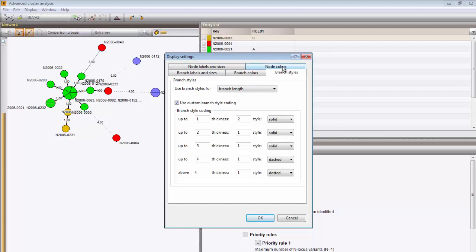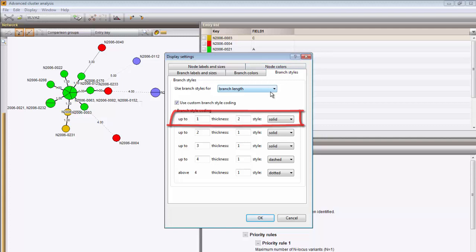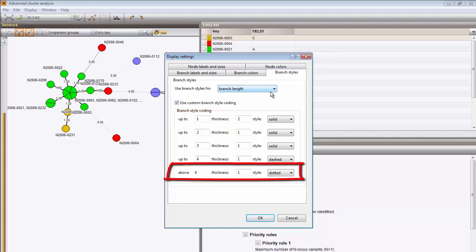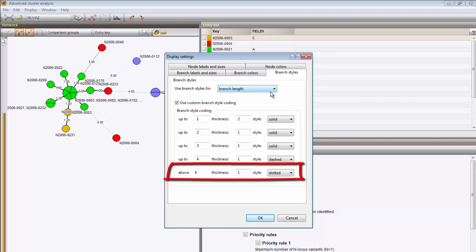You can also adjust the style of the branch according to the distance between the nodes. For example, a distance of 1 results in a solid line with thickness 2, while a distance higher than 4 results in a dashed line of thickness 1.